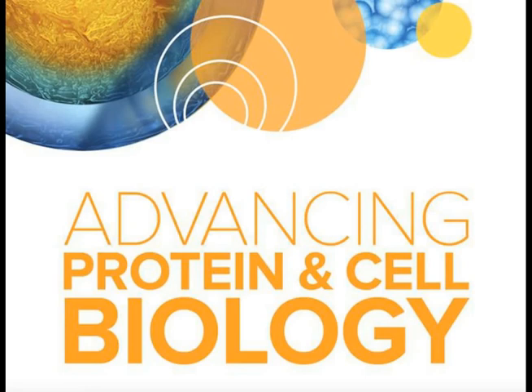Hello, thank you so much for your questions. So I will be happy to answer. Indeed, centering spheroids for imaging and automatic imaging is a very important point. And we are able to mitigate it by using two types of plates. One type is spheroid U-shape low attachment plates. They come either in a 96 format or 384 format. Those are from Corning. And another type is in spheroid plates. They are 96 format.